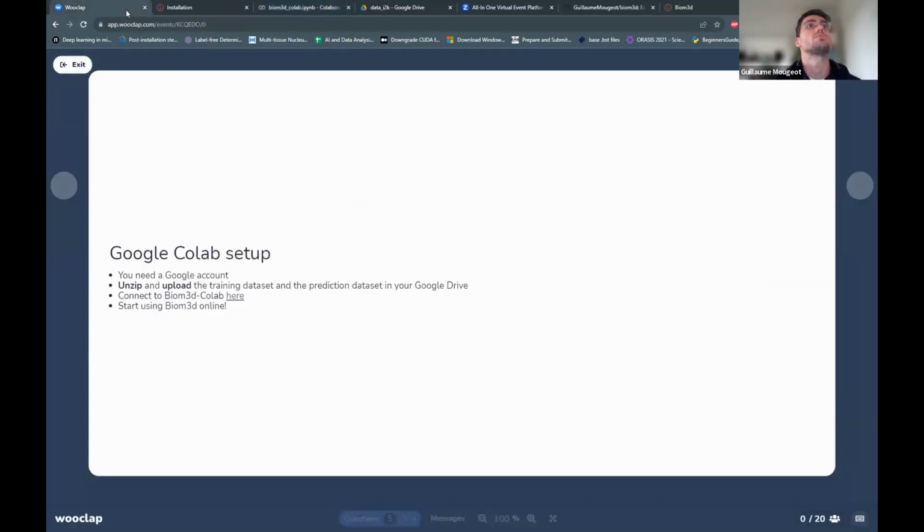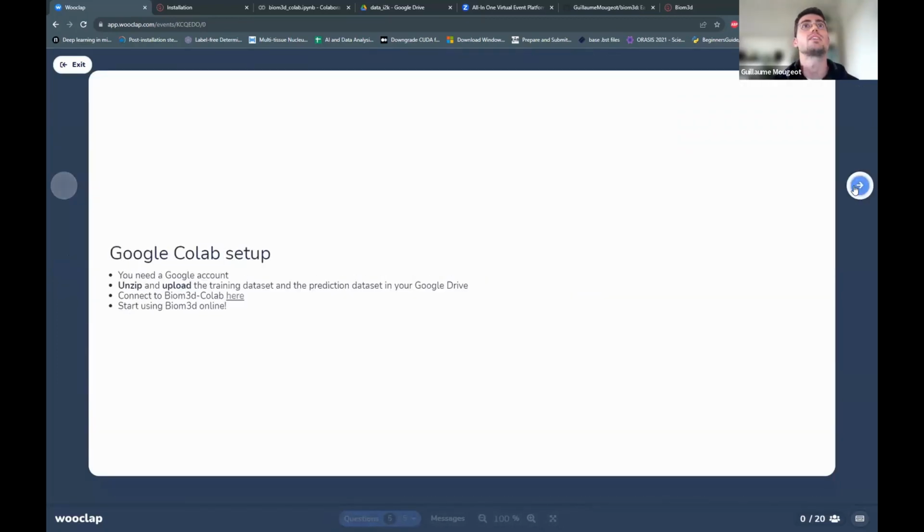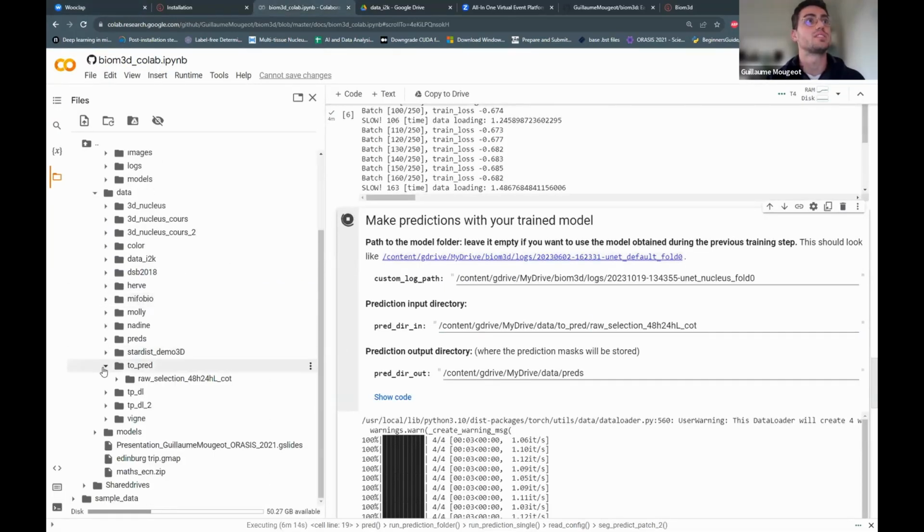We just came back on the Colab. I've noticed that at least 6 of you were actually interested in the local installation. So as we have a bit of time, I can also show you this local installation. And when it's done, you can actually download the model that was trained on Google Colab and use it on your own laptop.